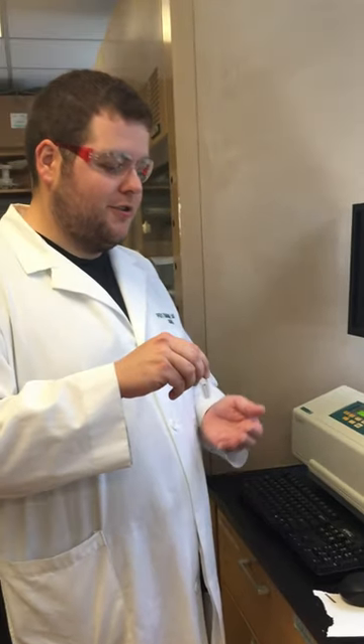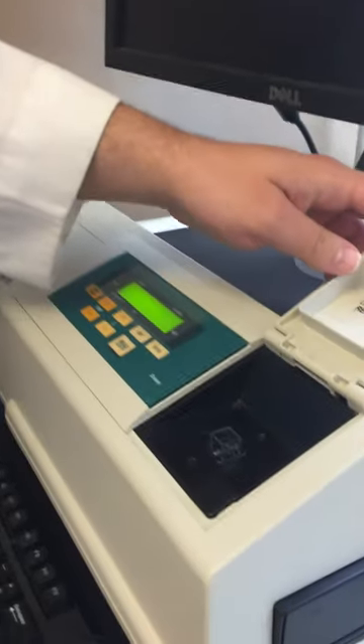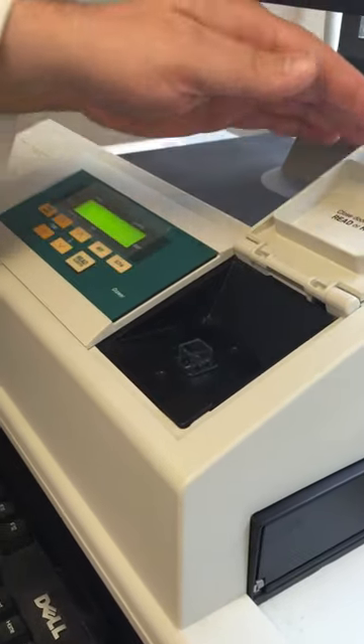Take the cuvette that has your sample in it and place it in the special photo here. Let's see how we put it correctly — in this orientation, so the light goes through the widest part of the bottom.